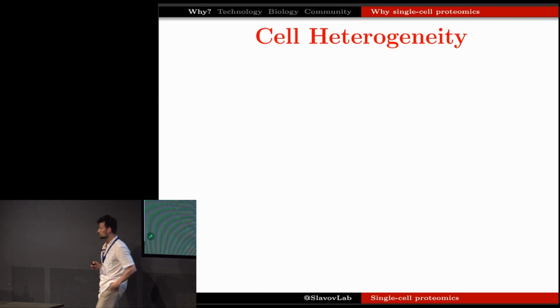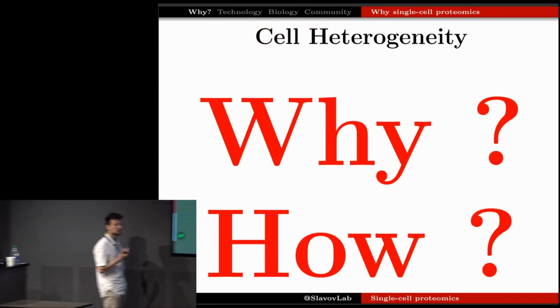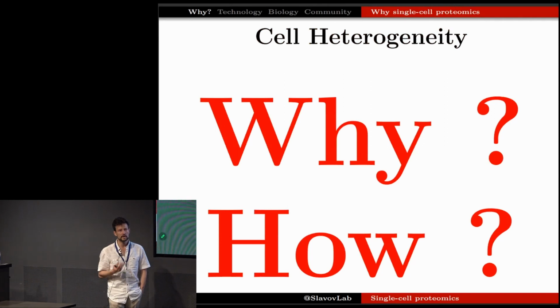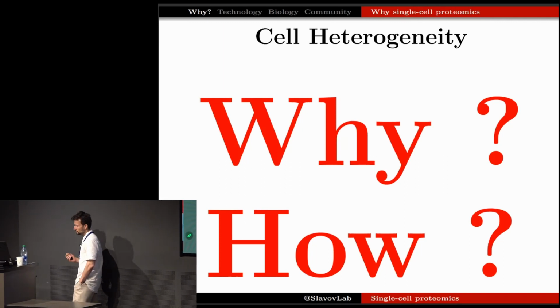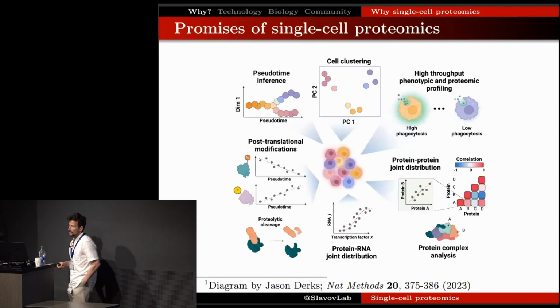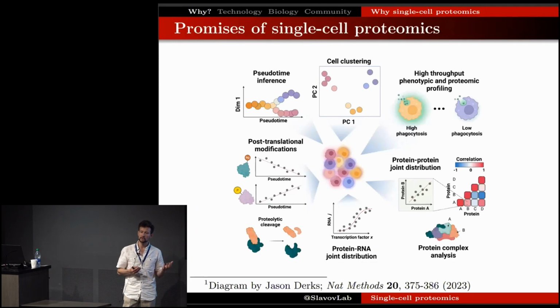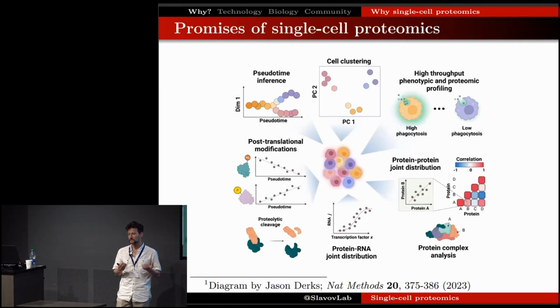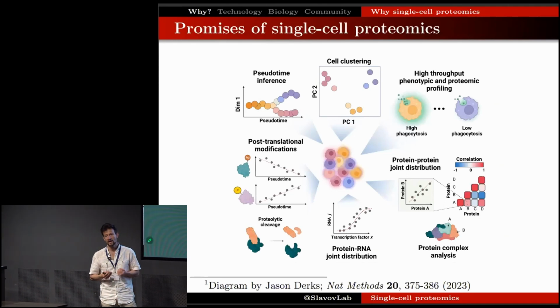What I think is special for single-cell mass spectrometry is the ability to use the methodology to ask questions about biological mechanisms, to be able to investigate causal relationships in protein networks that underlie the different functional biological behaviors that we observe. And mass spectrometry is particularly well suited for that because of its ability to measure proteins very specifically, as Judith Steen explained yesterday, the advantages over affinity reagents to detect epitopes.